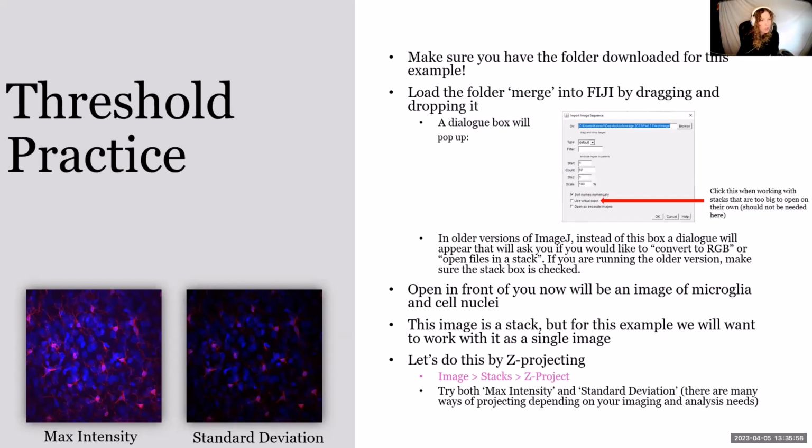I think one person has gotten quite ahead, so I will hold to address that. You're getting 1,500 data points. That's probably not from gating it. When you drag the whole folder, it doesn't do anything at all. That might be to do with how much RAM you have or the speed of your Fiji. I'm guessing if you leave it for 20 minutes, it'll go ahead and open then. Doesn't work for Mac when dragging. Are there any people who are Mac users?